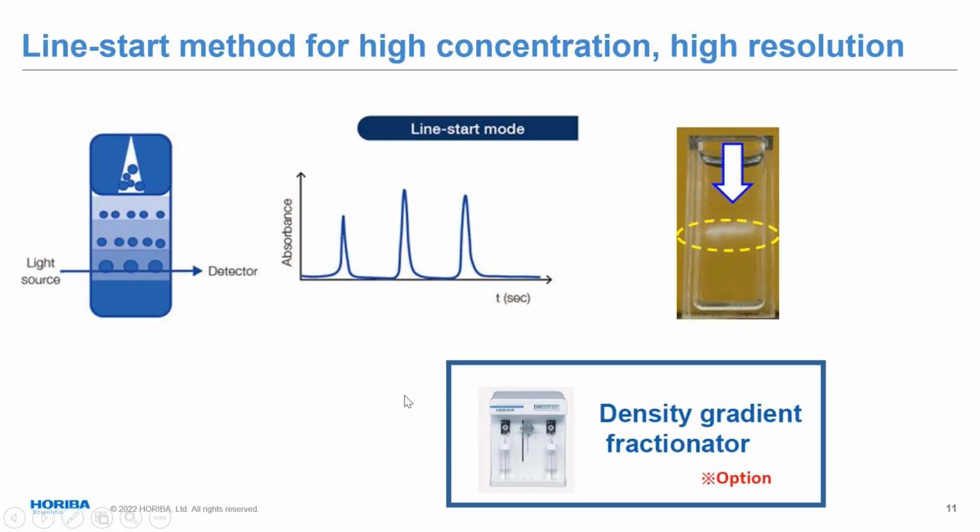And here you can see the other method, the line start method. It looks really nice and clean here. Obviously got the very large ones at the bottom, the medium-sized ones in the middle, and the small ones on the top.